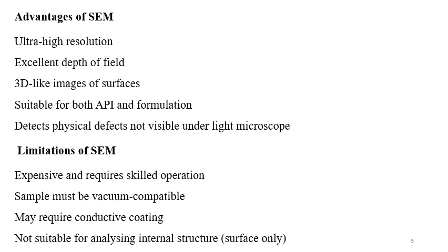Now what are the limitations? It is expensive and requires a skilled person for the operation. The sample must be vacuum compatible. It may require conductive coating and is not suitable for analyzing the internal structure because it can provide you the information of the surface only.